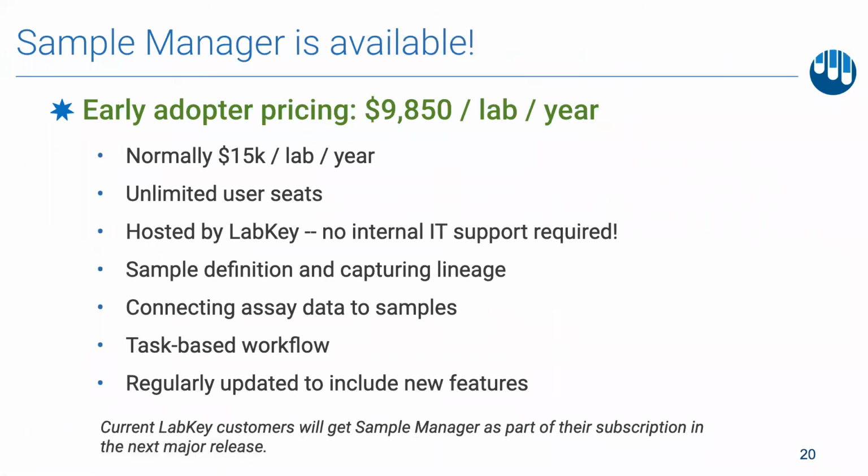And so as you've seen, the 3 key components of Labkey Sample Manager have been built out to enable sample definition and capturing lineage, assay upload, and assigning samples to a workflow job.